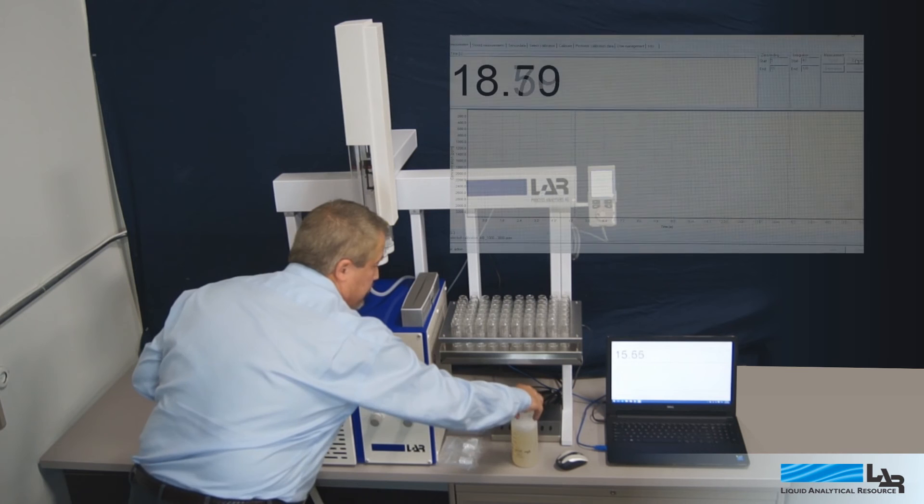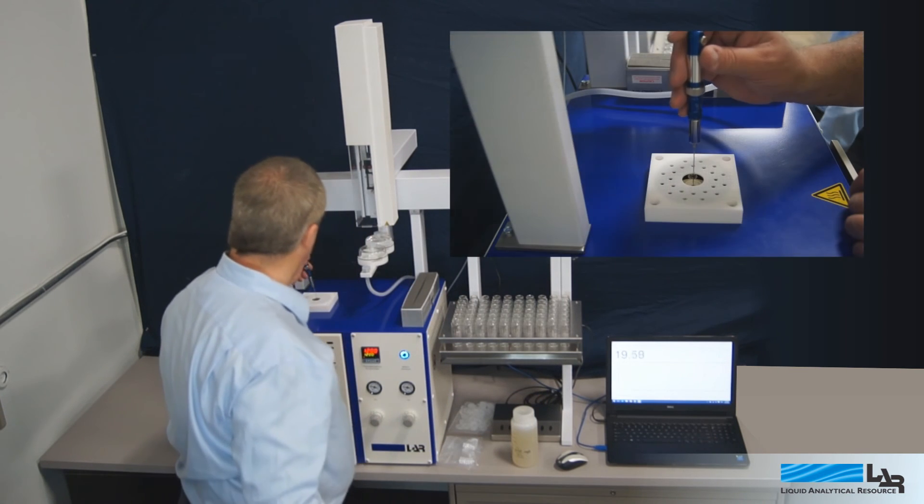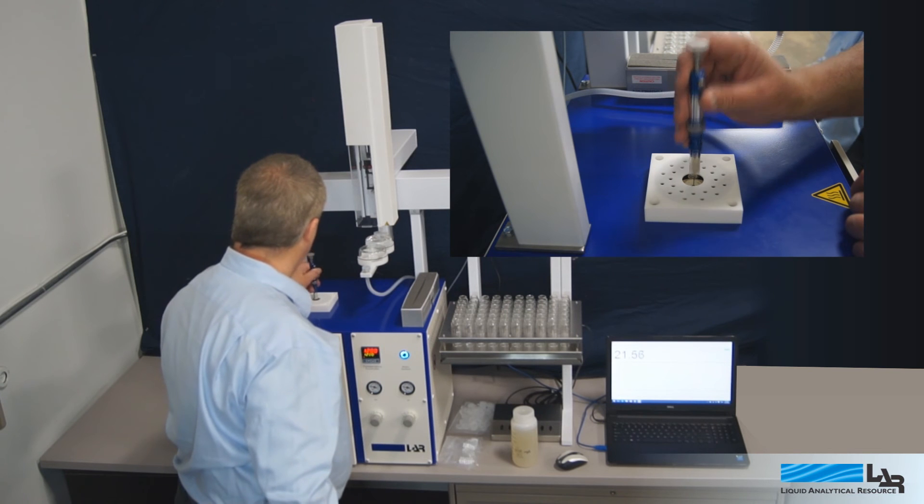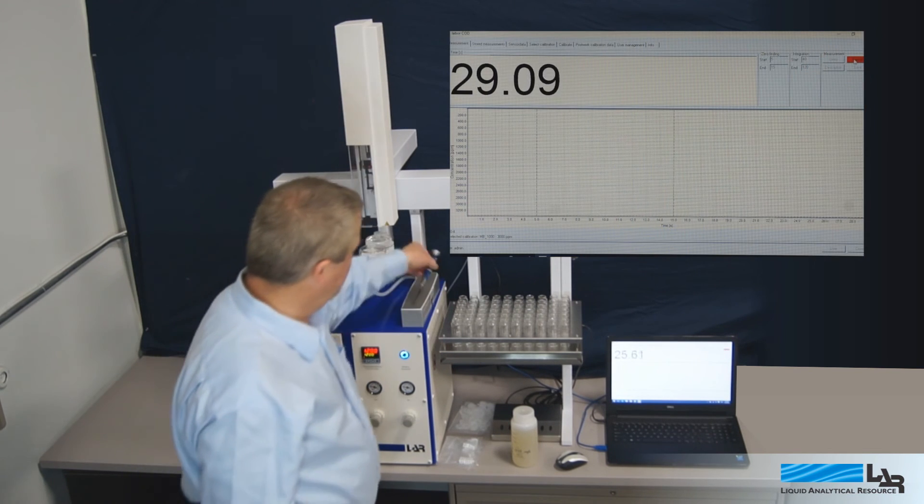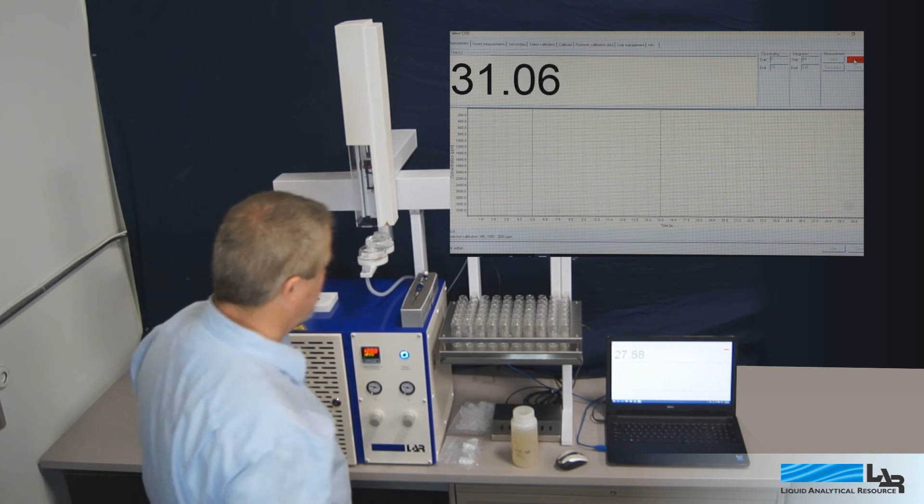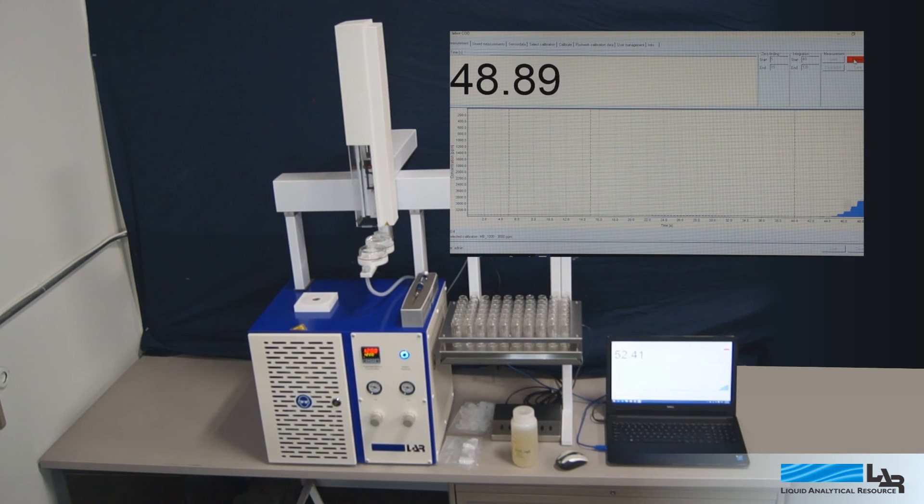In manual operation, the operator starts a measurement cycle and the software alerts the operator when it's time to inject the sample. After 40 to 60 seconds, the resulting curve begins to appear on the screen. The analyzer continues the measurement for 180 seconds or until the operator stops the cycle. The final result is displayed and can be exported as a CSV file for archiving and analysis.